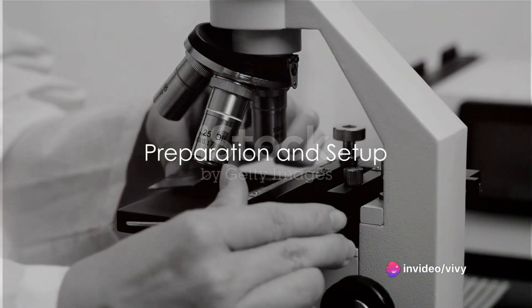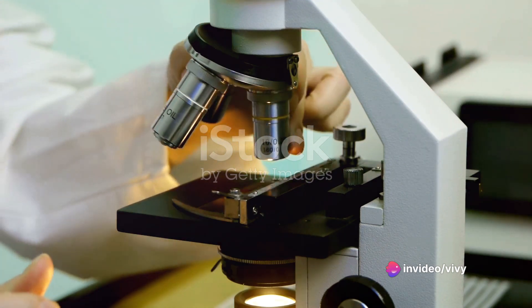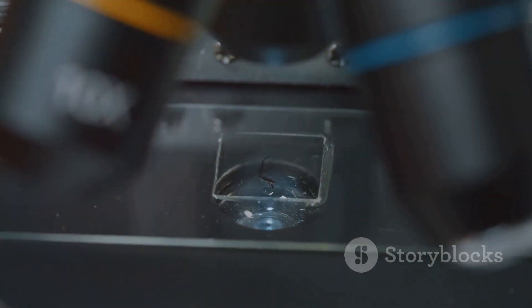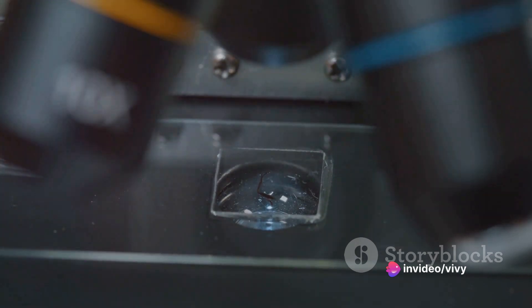Have you ever pondered the intricate beauty of a plant cell under a microscope? It's a world unseen by the naked eye, but one teeming with life and fascinating structures. Today, we journey into this microscopic universe, revealing step-by-step how to bring a plant cell into focus under a light microscope.